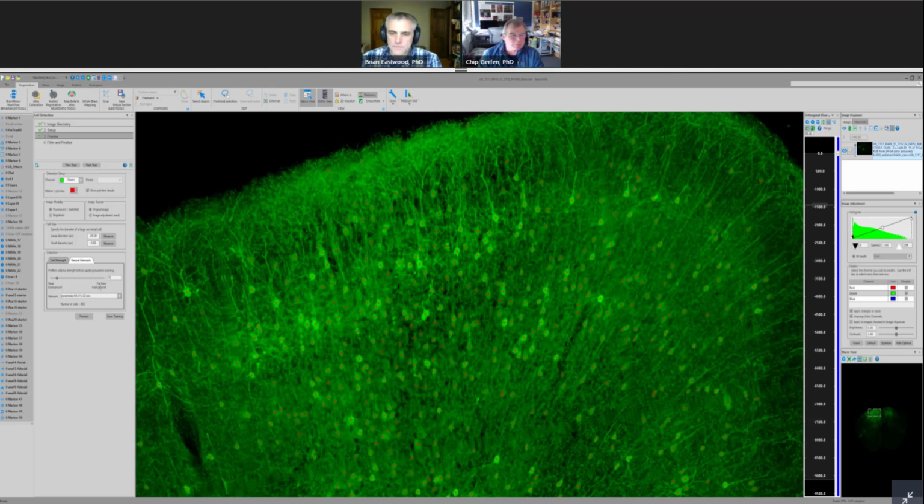So basically, is part of that because it's trained by humans? And also, does that mean that if it's hard for us to see, it's going to be hard for a neural net to achieve that? Yeah, and I think your point there, Nate, about it being trained by humans: when I say there are 90,000 example images, it's not just 90,000 images of cells. It's 90,000 images that have been labeled as this is a cell and this is not a cell. And so a lot of the work involved in building neural networks is the actual accumulation of this labeled image data. That's where a lot of the work lies.